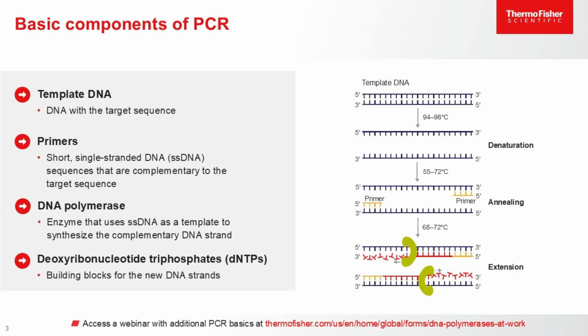Let's look at the components of PCR and how it actually works. The standard PCR reaction includes DNA template, which is a sample DNA that contains the target sequence. DNA polymerase, this is an enzyme that is key to PCR. It uses single-stranded DNA as a template to synthesize the new complementary DNA strand.